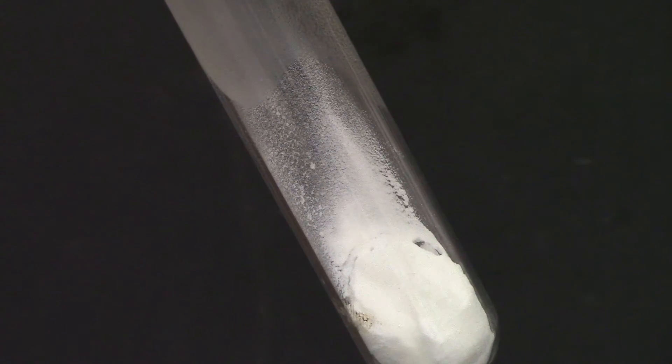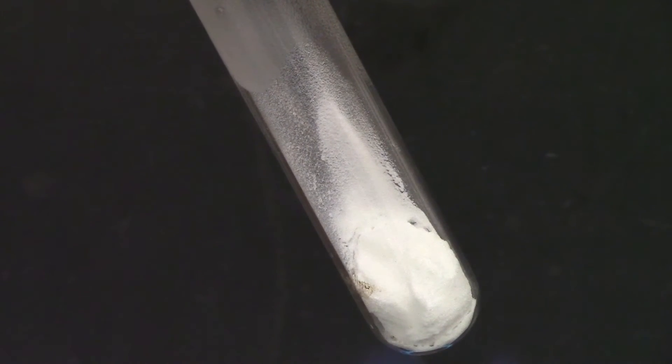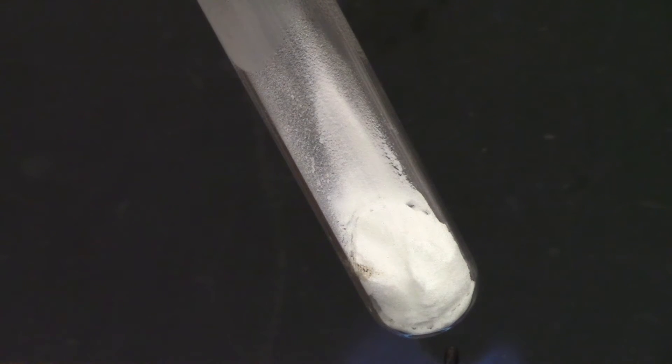Notice that we have a lot of moisture forming on the inside — that is water vapor that is condensing on the sides of the test tube as the baking soda decomposes.